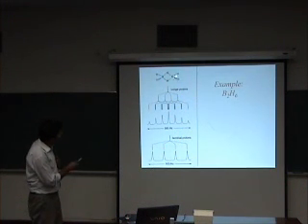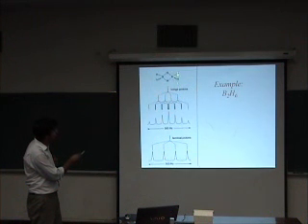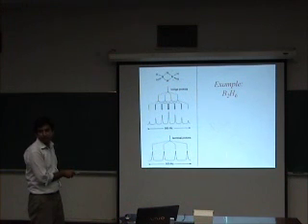And the terminal protons, each one of them is coupled. Since the 2 protons are magnetically equivalent, you do not see the mutual coupling between the 2 protons. So each terminal proton is coupled to a boron and you get 4 lines.